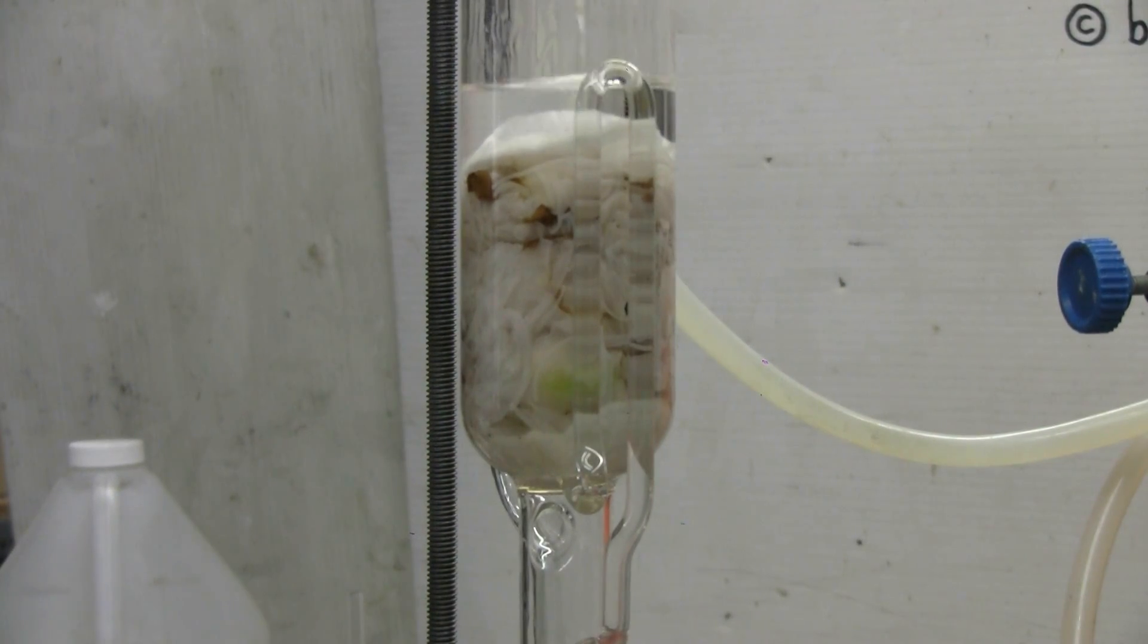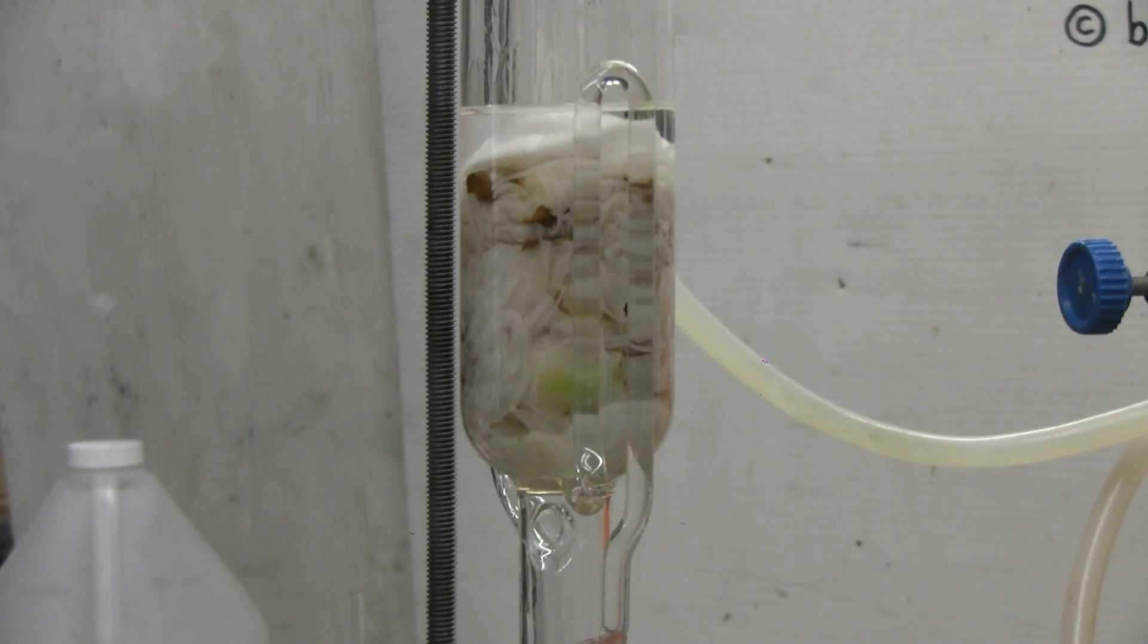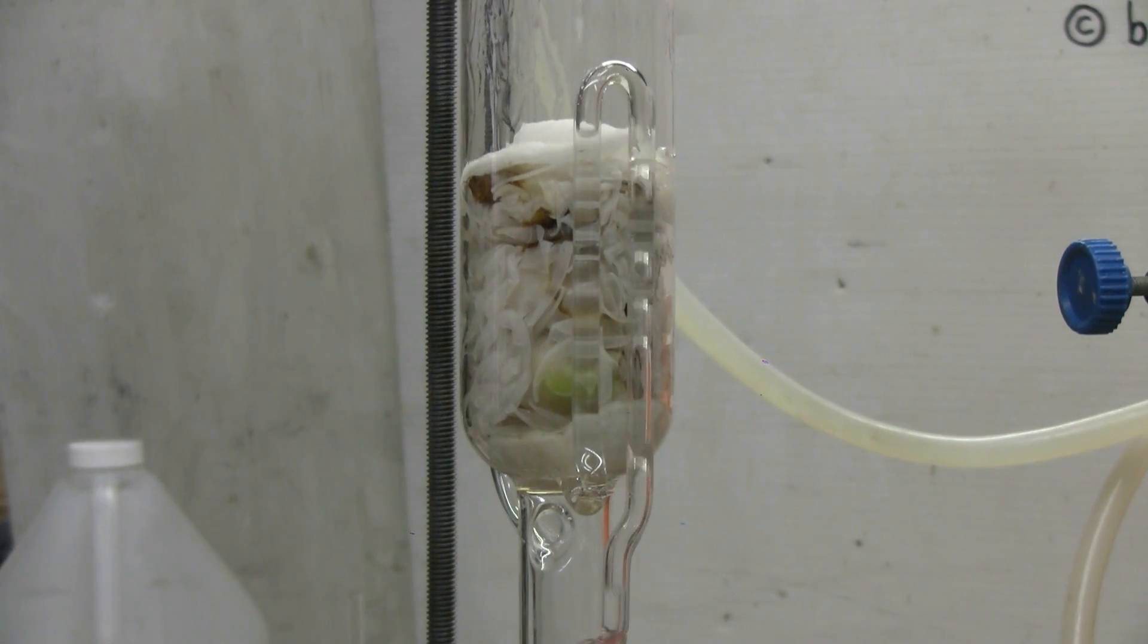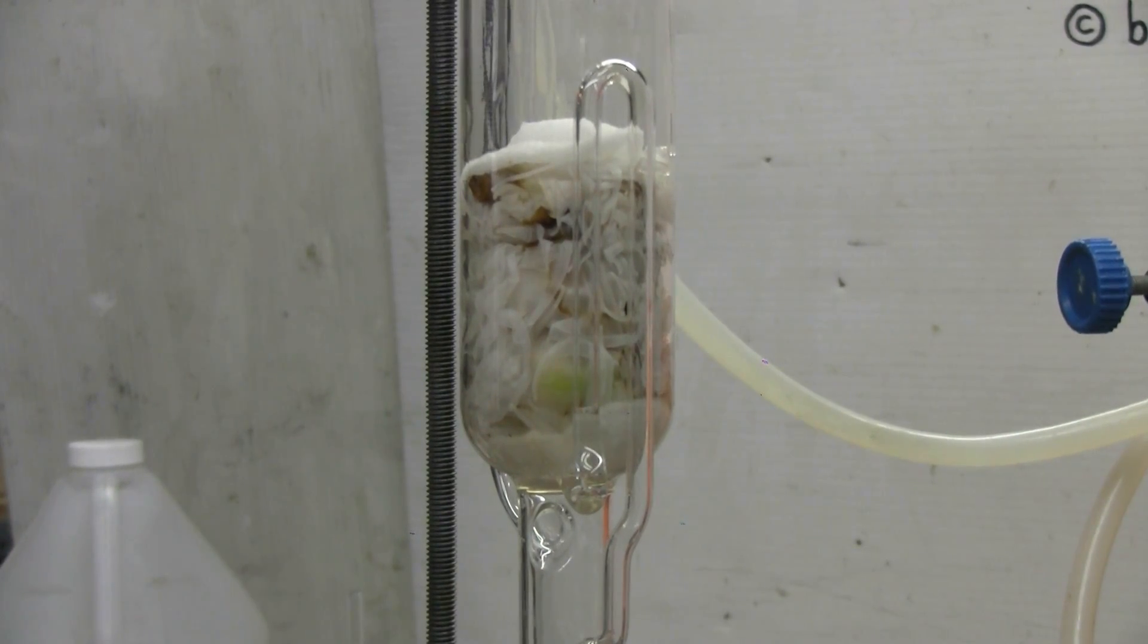This is cycle number ten. Nearly all of the color has been extracted from the peony flower petals in the Soxhlet chamber. However, I'll be stopping at this point and switching over to simple distillation to recover my ethanol.